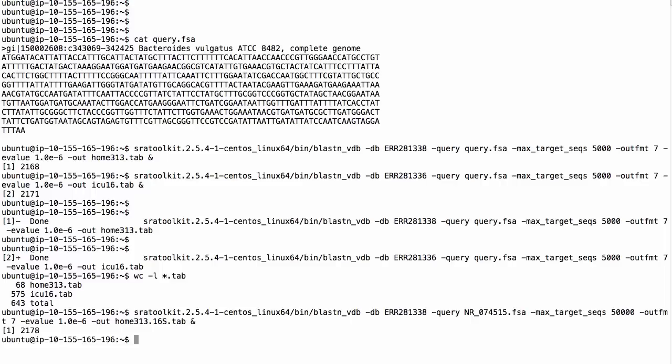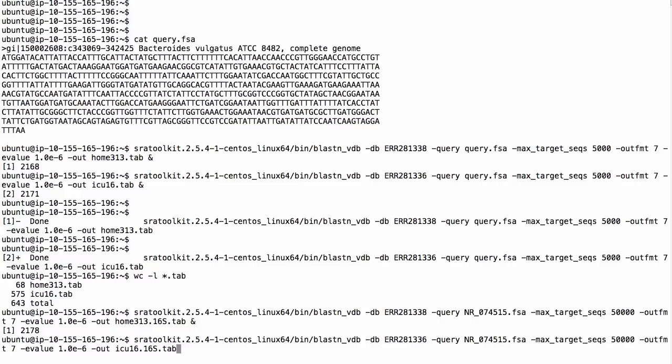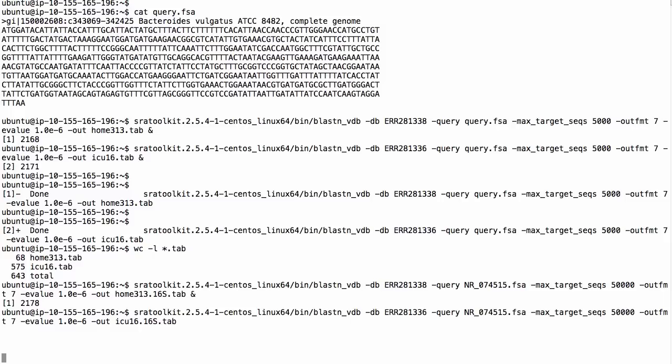All other parameters are the same — that was the 313-day home run, and this is for the 16-day ICU run, also with max target sequences set to 50,000. I should mention that you probably could not do this on the NCBI website, since it's a shared resource and we limit the total CPU one process can take. The good news with standalone BLAST is that you can use your system as much as you want, or as much as your administrator permits.